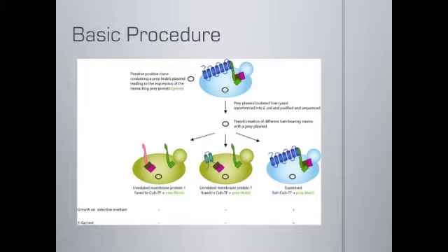Then we take colonies that have grown up on these plates, on these strains, and we put them on a selective medium to see if they'll grow on that. The idea of this selective medium is that only the bait HspB2 and our prey protein will grow on that, and the unrelated proteins will not because of the lack of interaction, lack of resistance. So you see at the bottom where it says growth on selective medium, under the unrelated membrane proteins there's no growth, and under the examined there is positive growth.